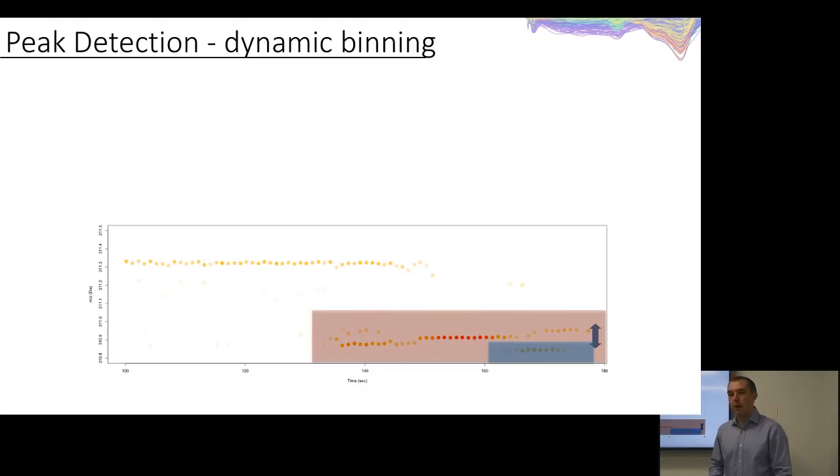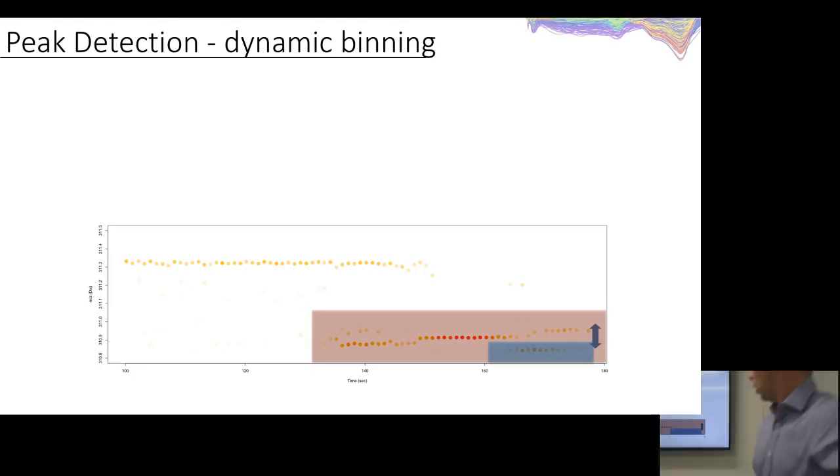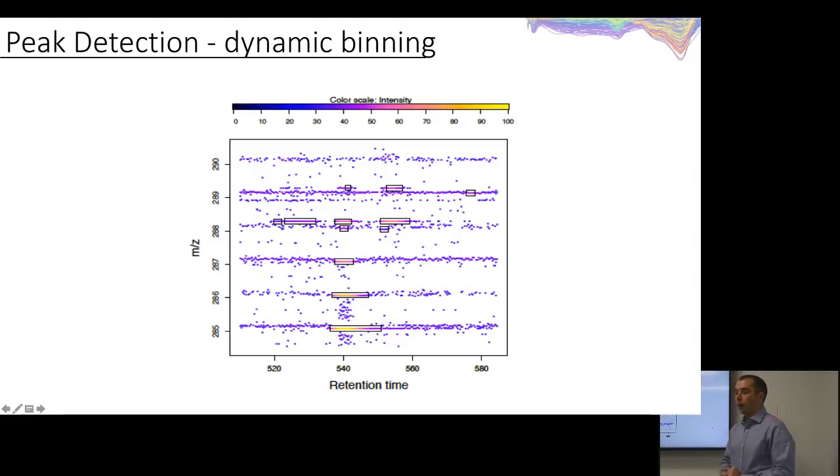And what happens is we actually track from point to point to point, and the system has to say there has to be a detectable and traceable path from one to another. And I can't deviate in mass too much from one side or the other. And so as I do that, you can see here that it's going to start to wiggle through this, and that's exactly what it does. And what's very nice here is because I've done this backwards, I was able to find the second one as well. So after that's done, I've done this algorithm, I've done this pass over the entire file.